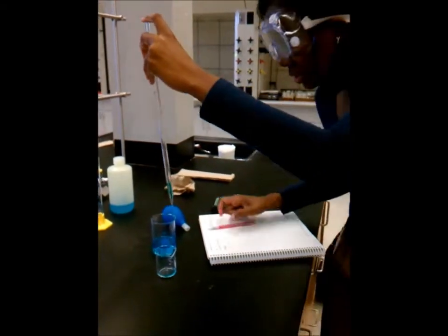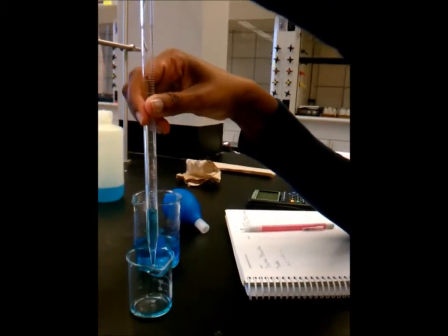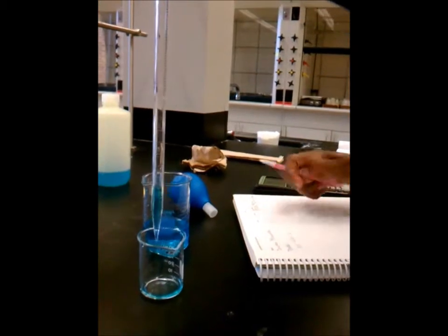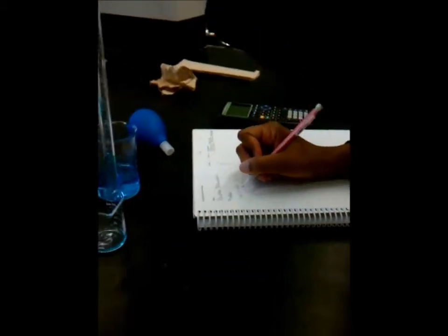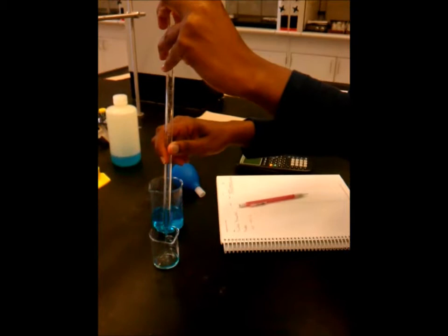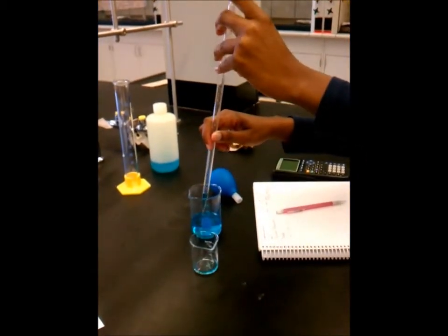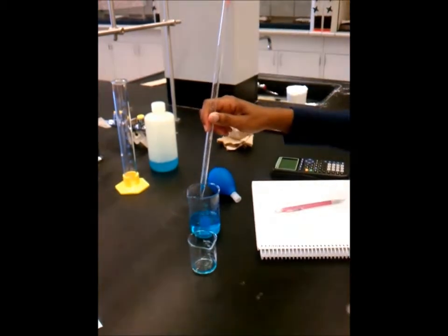And I'm going to measure. And I came right up, the meniscus is right at 10. So I'm subtracting the 10 from the 10.2, and I'll come up with 0.2. And then I'll just drop the solution next to the waste beaker.